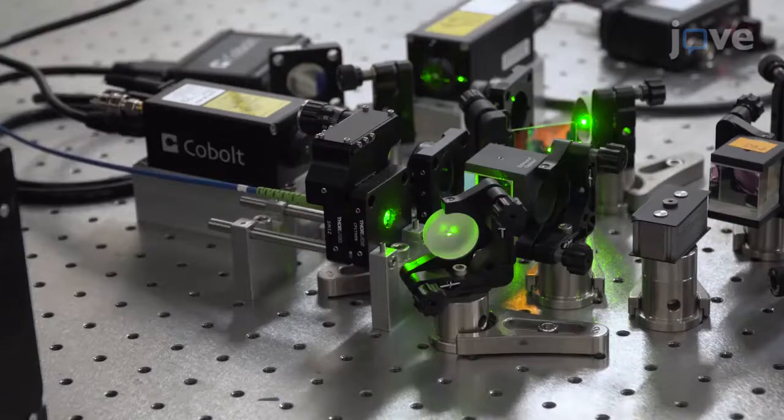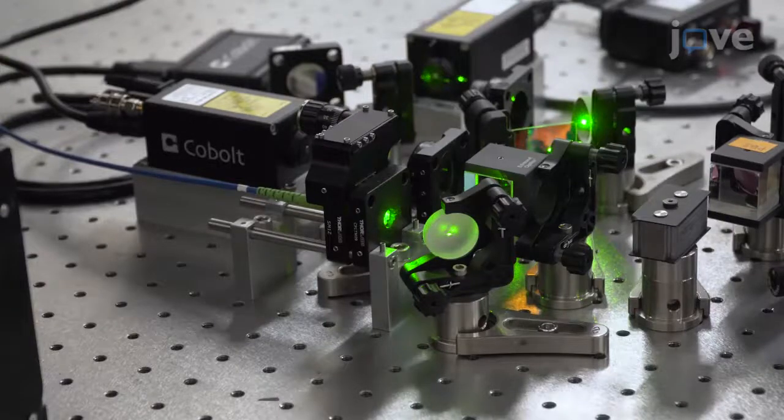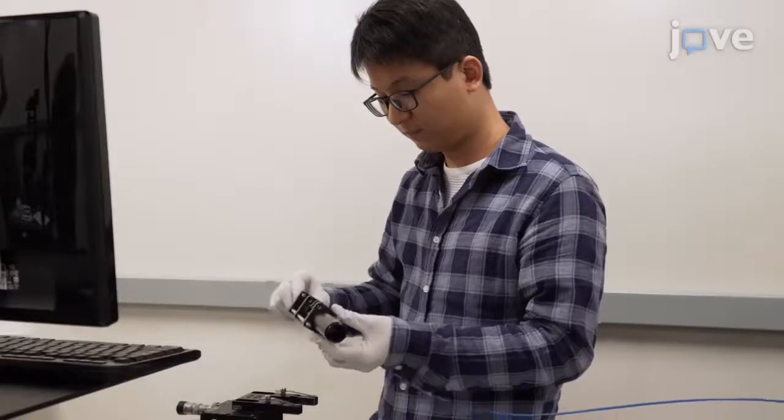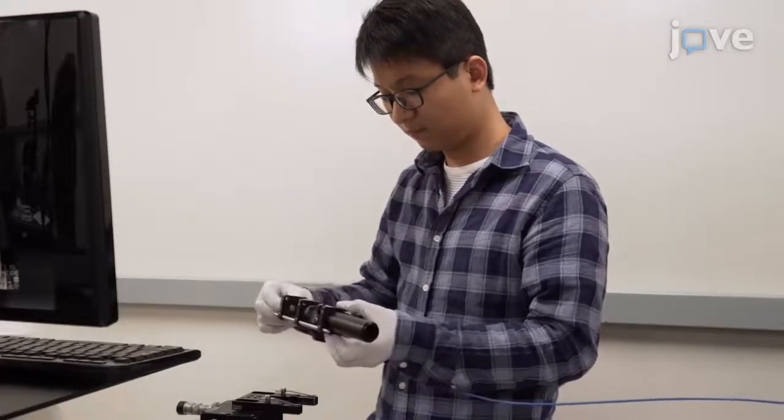The combined beams are coupled to a single-mode fiber as efficiently as possible. As a final preliminary step, assemble a collimated light source in a cage system.